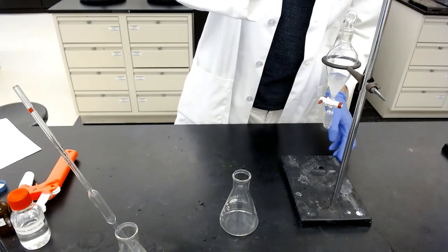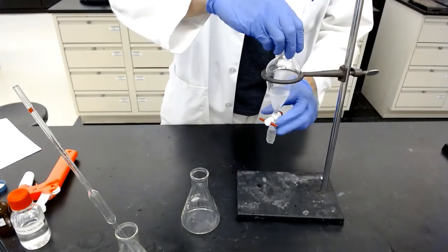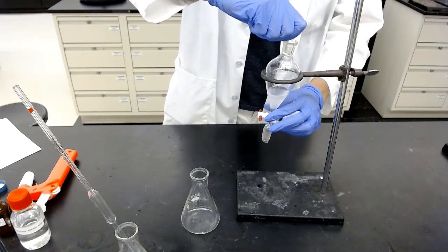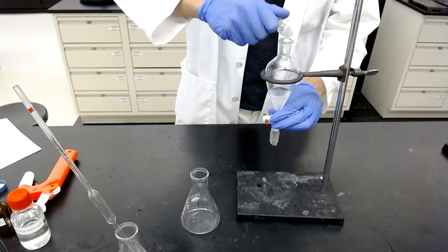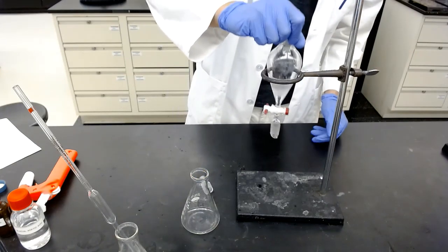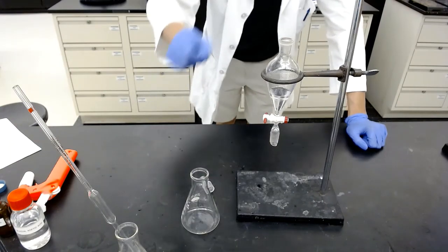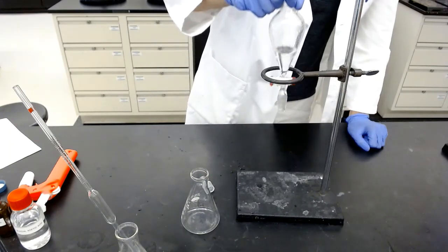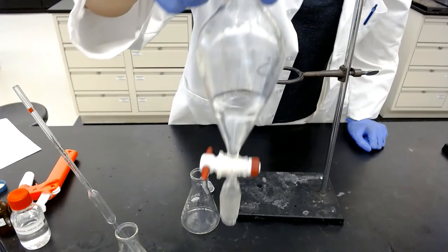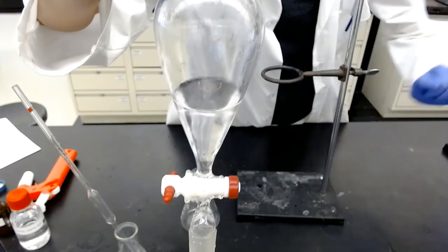Let it settle down. All right, I think maybe go this way, make it look better for you guys. All right, take the stopper away. Now you just have to wait. You can do a little swirling to facilitate the 2 layers forming. All right, it's pretty fast. So now I'll bring this closer. As you can see, it's a little hard to see. Yeah, but there are 2 layers, right?